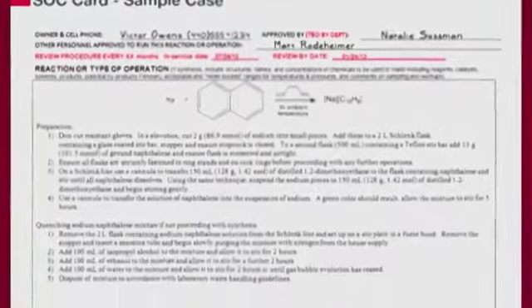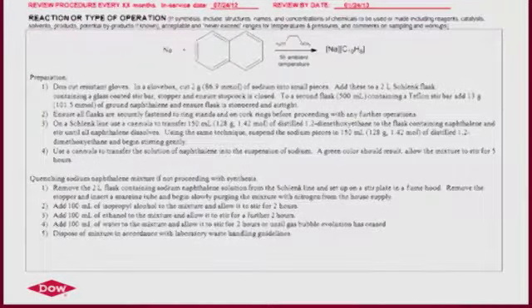Step 2. Detail information about the project itself. This is the place where you will list specific information such as procedural steps, chemical reactions, quantities, and operating conditions. This is the story of your work, and anyone in your lab should be able to clearly understand your project.